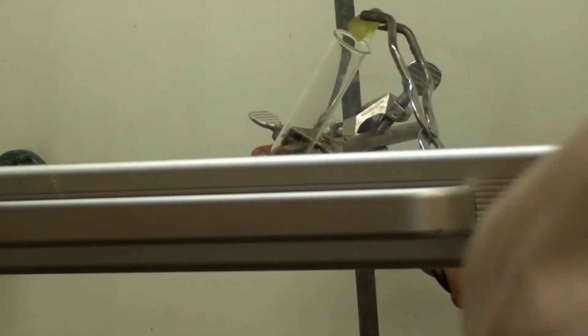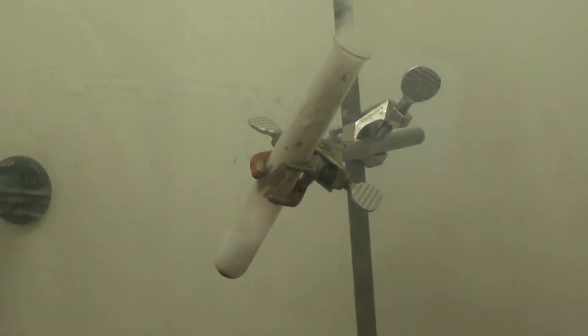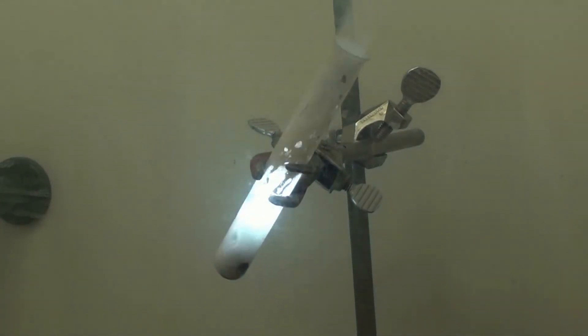Now we've added barium chloride and the flame now burns with a greenish colour. What we have shown you today are the basics for pyrotechnics. The colour of the flames change because of the different added salt. The same principle applies to, for instance, fireworks.